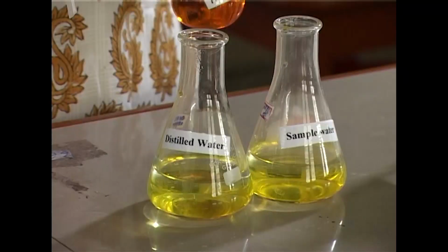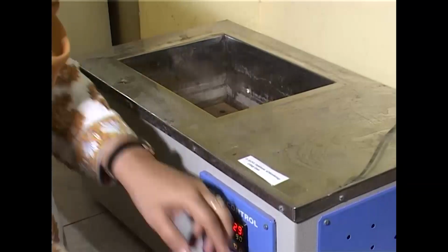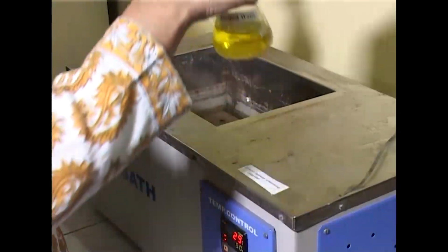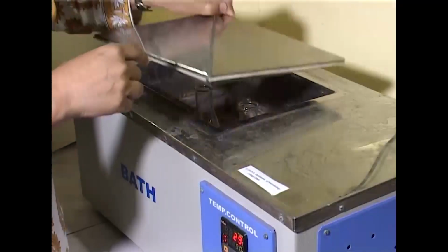Now another bottle is taken where we do not take the water sample but simply distilled water as a control. So we have two conicals, one with the water sample where we have added all the reagents and one with the distilled water where we have again added all the reagents. The one with the distilled water is set as a control. Now when everything is added, we incubate both flasks, the control as well as the test sample, at 100 degrees Celsius for 1 hour in a water bath.